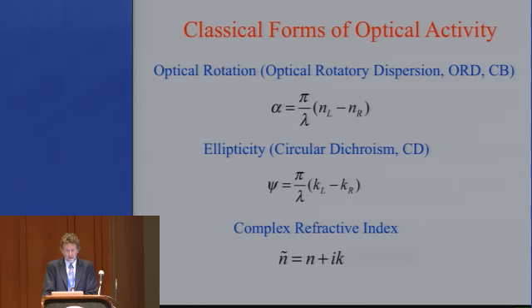Definitions of vibrational optical activity. I just want to start with the very easiest thing. Optical activity comes in two forms. You all know optical rotation, and then there's circular dichroism.